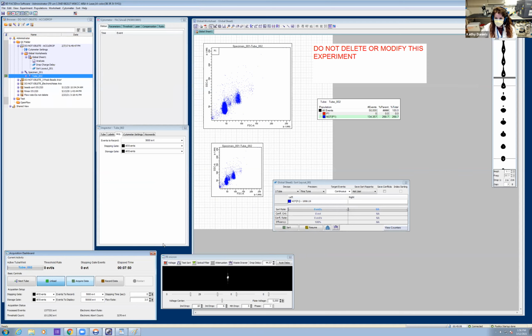There's a couple of questions there about that. Is one better than the other? It's the same with lots of these things, isn't it? We would show people how to do it manually, because that really is the way the automatic way is doing it as well. I quite often do it manually rather than using the automated one. I find I'm quicker. Yeah, I would add to that exactly. If you know what you're doing, it's as quick to do it manually as it is automatically.